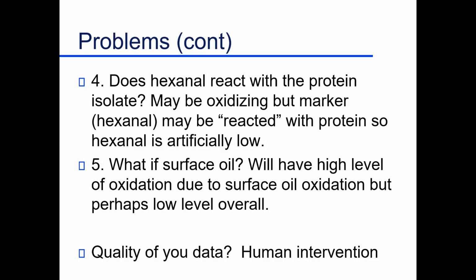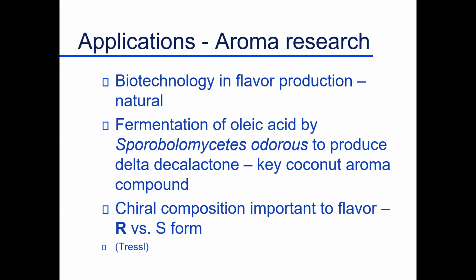Anytime you're doing an analysis, you need to know what you're doing. You need to know the pitfalls. You need to take good care along those lines. And that requires that you know gas chromatography really well. So that's why you're all sitting here, right? Maybe it's required. Anyway, you just have to be careful and think about what you're doing. Think of all the options. Don't do things blindly and take a number and go with it.